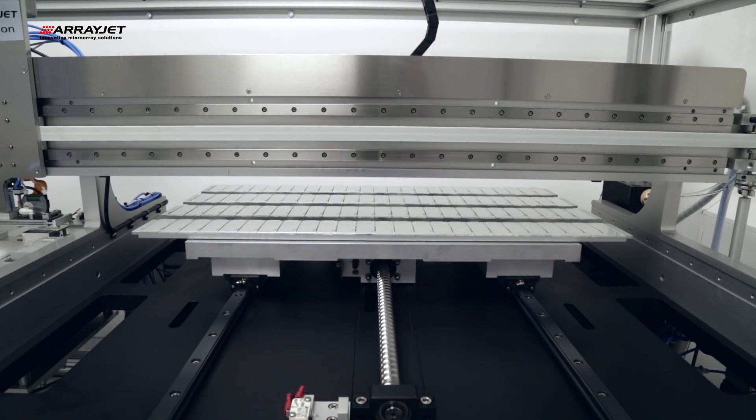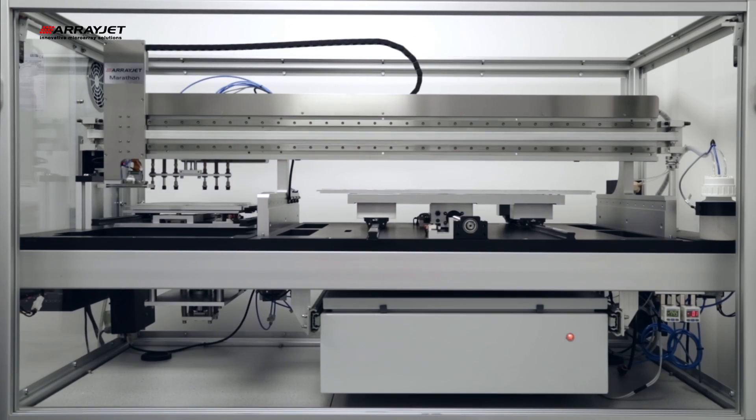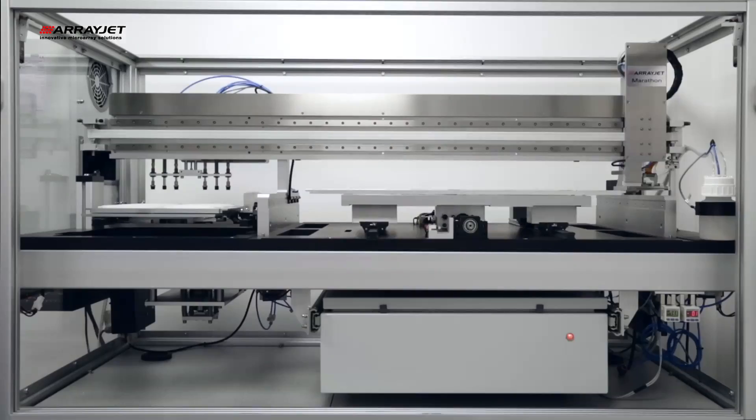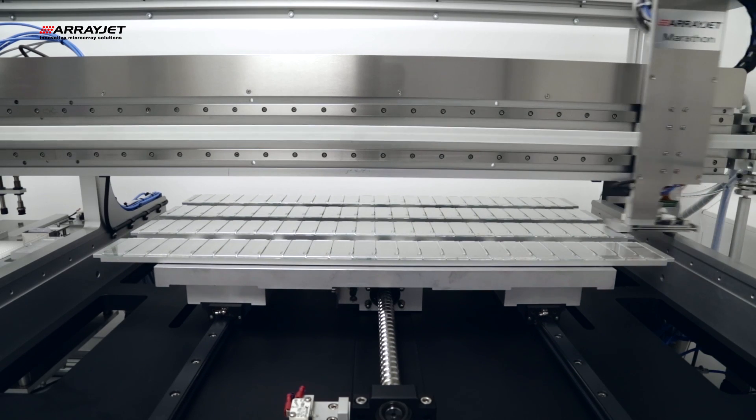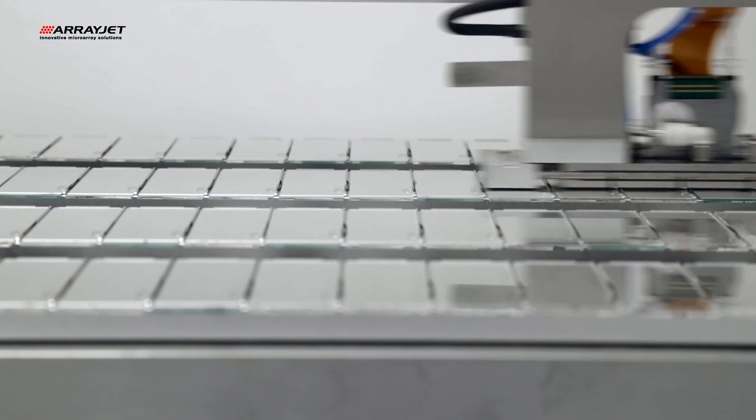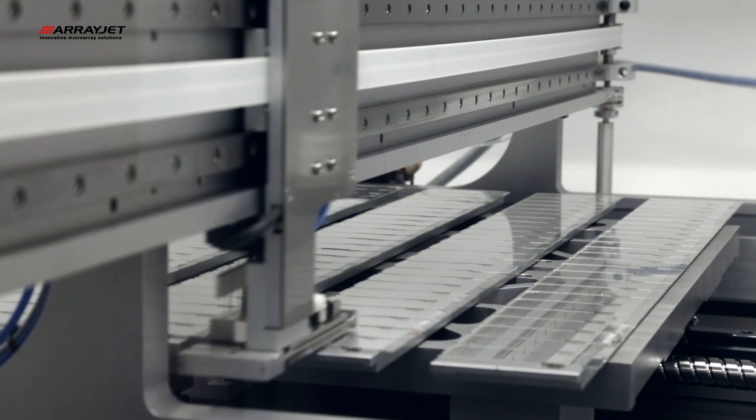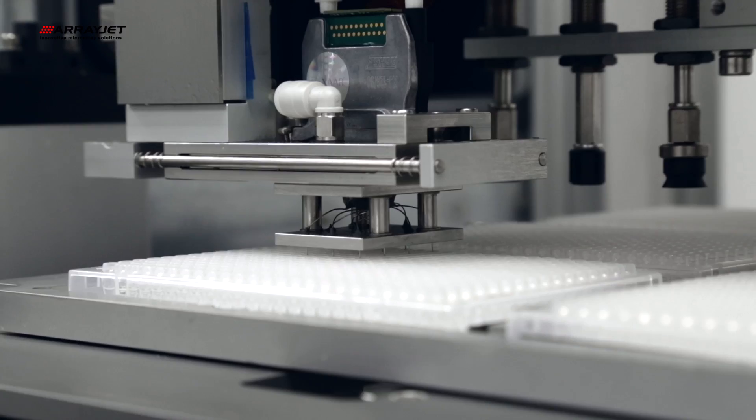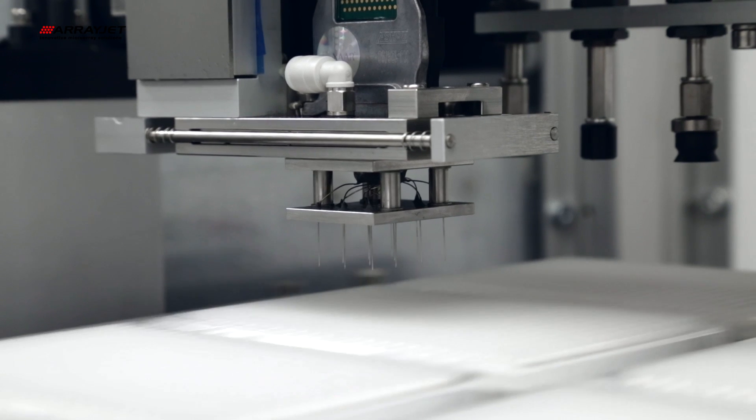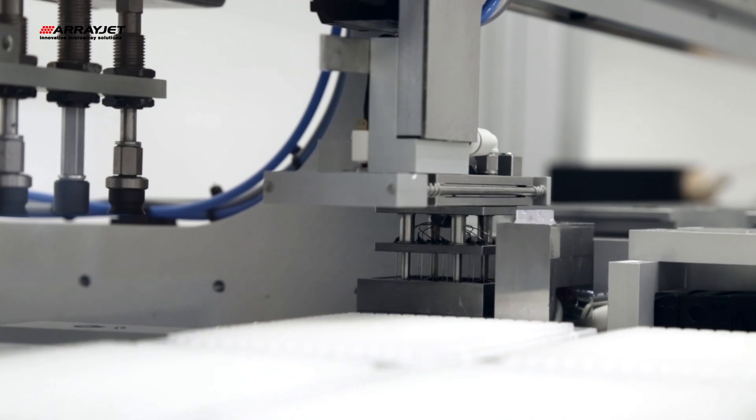Its printing technology is the fastest on the market and produces the largest batch sizes, available in one print run of 1,000 slides. The heart of ArrayJet technology is its non-contact inkjet printhead and jet spider sampler, which enables rapid printing cycles to be conducted in less than two minutes.